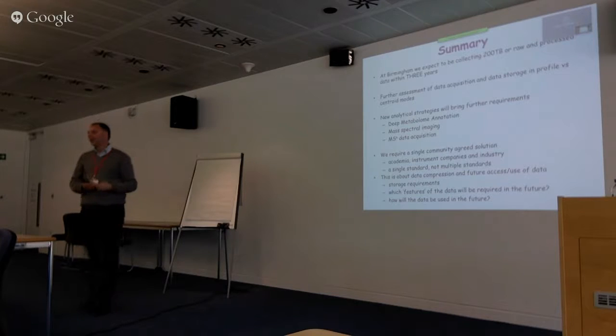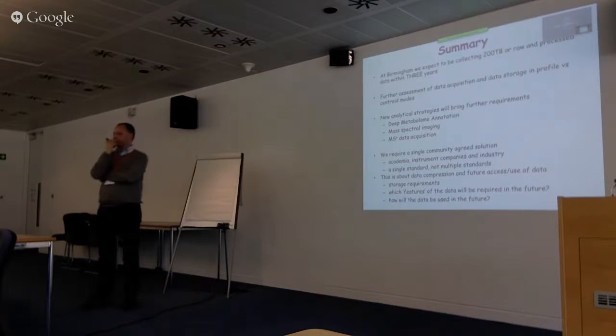Yeah, I think the difference between this and, say, sequencing is that with sequencing, you just get the sequences faster. Whereas new instrumentation is more sensitive, so you will see more as time progresses, going deeper into the metabolite profile. But I think that's a relatively small contribution compared to just the general increase in the size of the field.